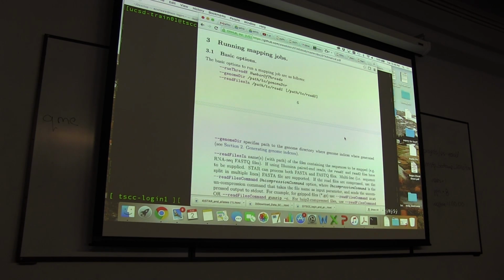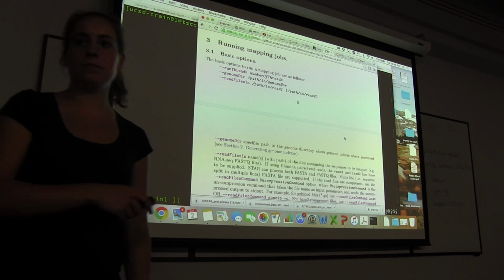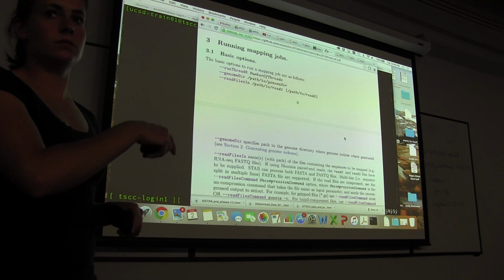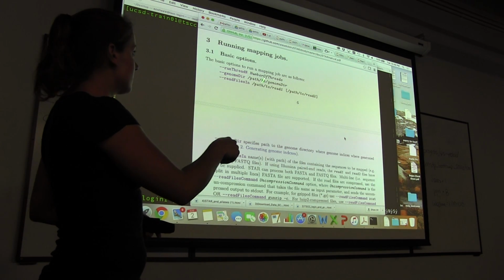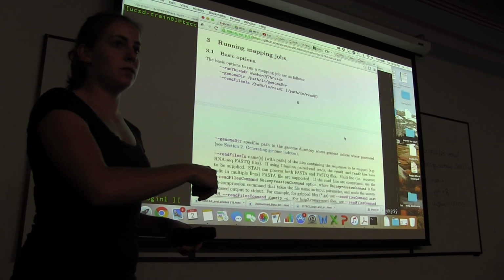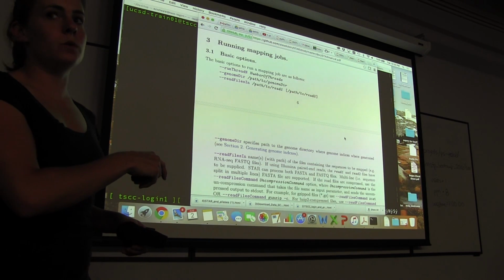Okay, so I'm going to encourage you to not cheat and look at the command that I probably already put in this core document. Take the next 5 minutes to work with the people around you, discuss these options, go to the STAR manual, go to the different submission parameters for running mapping jobs, read the different arguments, and see if as a group among the 2 or 3 of you next to each other, you can understand what arguments you're going to put for each of these flags and which flags you want to use.